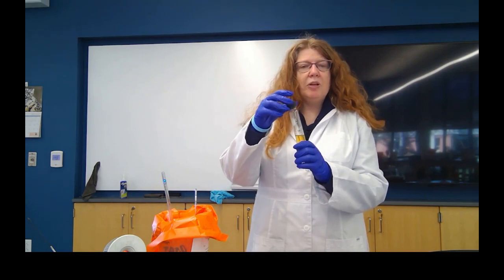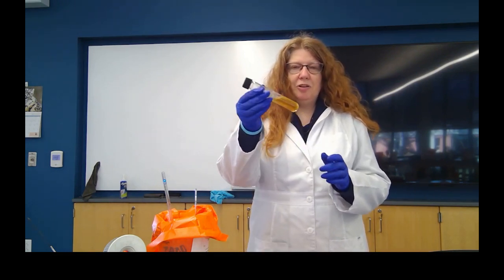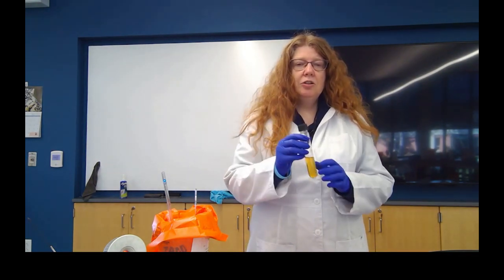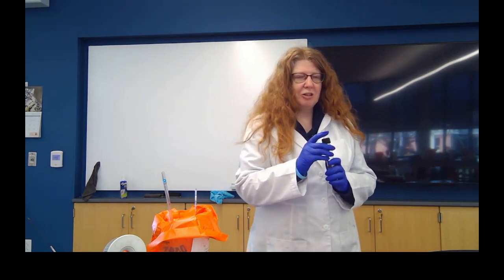The cap is only on here loosely to let any steam out. And you can see that the tube is liquid. So I'm going to set that aside until it's ready to be used.